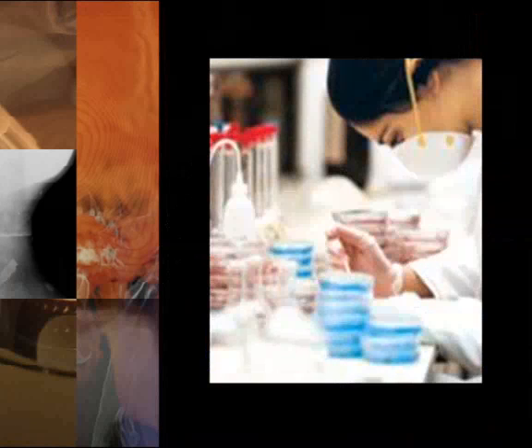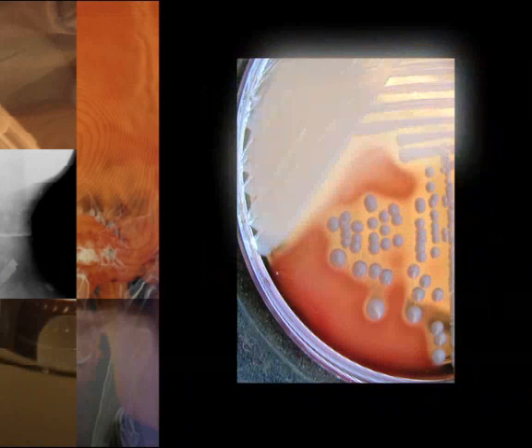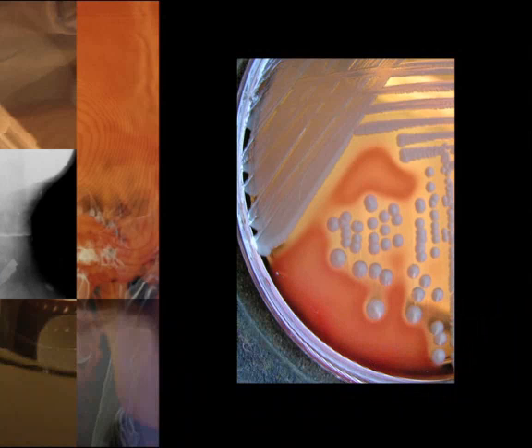So what they'll do, they'll incubate it in a hot environment overnight or for 1 to 2 days, and during that time the bacteria will have a chance to grow. And now what you see is these white or gray smears and white and gray circles. These white and gray circles are actually clusters of bacteria, so growing, living bacteria that are grouping together and feeding off of the nutrients on that plate. So depending on the shape, the size, the structure, the clustering and pattern, and the color of the bacteria, the medical laboratory technician can tell what type of bacteria it is.